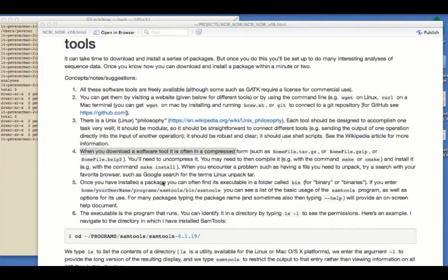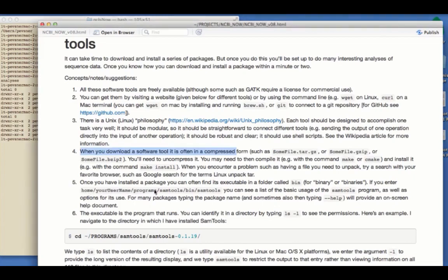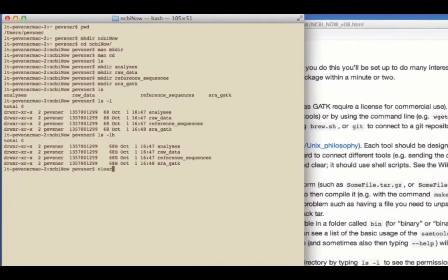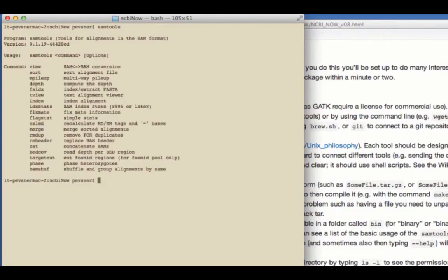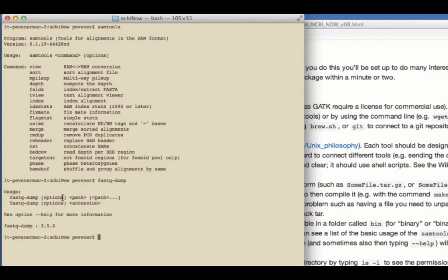Once you've installed a package, you can often find its executable in a folder called bin, where that stands for binary or binaries. And if you type the name of a package, you may go from your home and your user name to a folder you've created, where you've put a particular software package, and then you find a bin directory. And there, you can see that if you type the name of the executable, SAM tools, for example, you get a list of the basic usage. Let's go just do this over here. I'm clearing, and then I'm typing SAM tools. In my case, I've added SAM tools to my path, so I don't need to specify exactly where the executable is located. And I can see basic information about the usage and about the different commands that I can use. And so it is, for example, with the NCBI tool, fastqdump. I can get information on the usage and the options that are available.